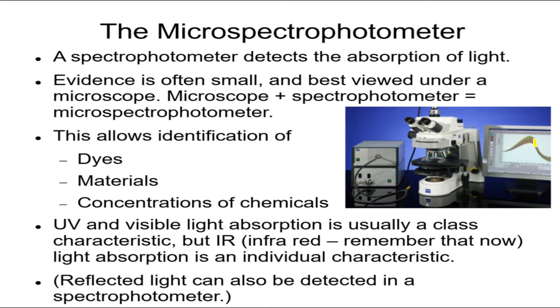Absorbing at the same wavelength. Okay, so that's what this microspectrophotometer is doing. This is what it looks like. So you can identify different dyes in the fibers. Sometimes you can identify different materials.